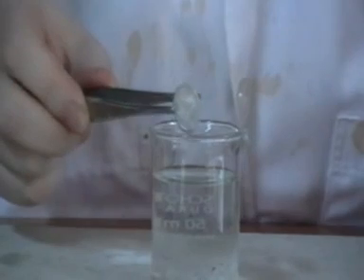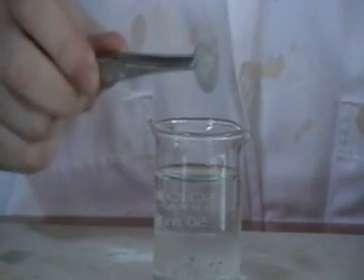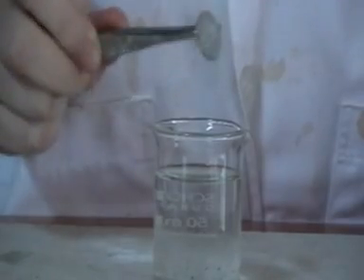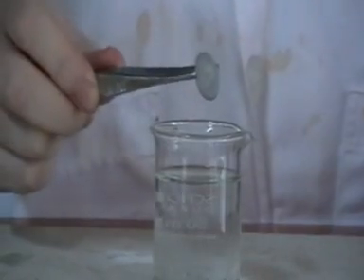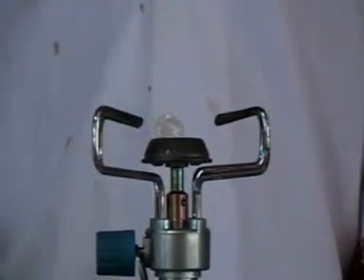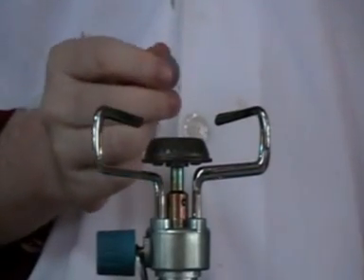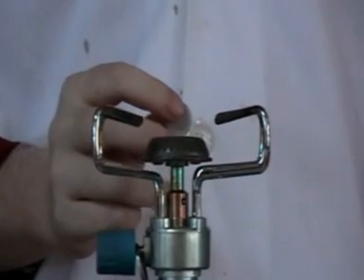The copper coin will look like this - it has turned to silver. And then if I want to change it into the gold coin, I have to heat the coin in the flame. I'm going to heat this silver coin in the flame to change it into the gold coin.